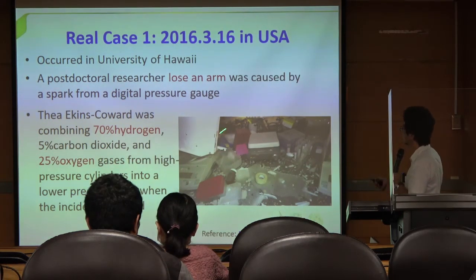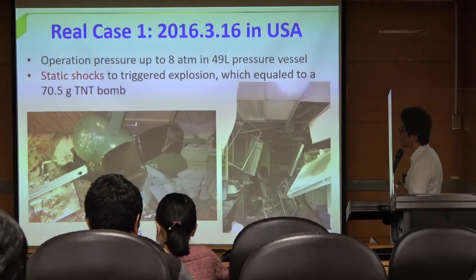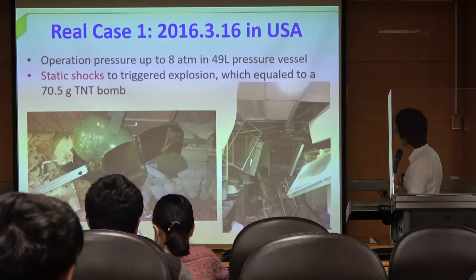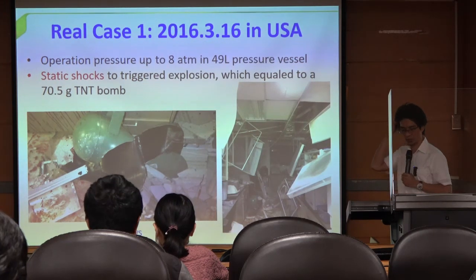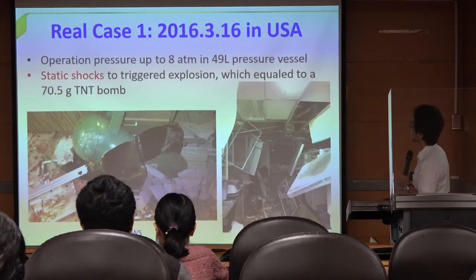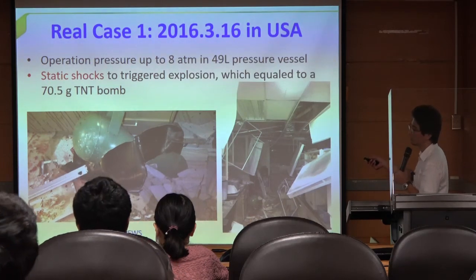So it's the consequence of the explosion. I only use these photos. You can see lots of blood nearby. She was working here, I think. All of her laboratory was destroyed, and she also stayed in the hospital for one month, I think, or more. So the static shock was the trigger for the explosion.